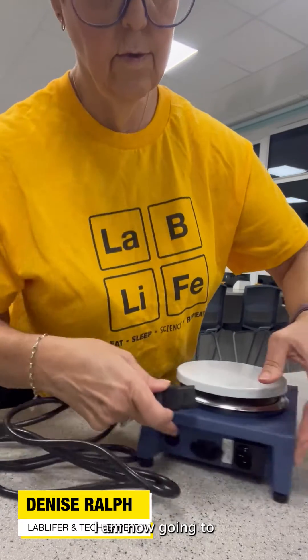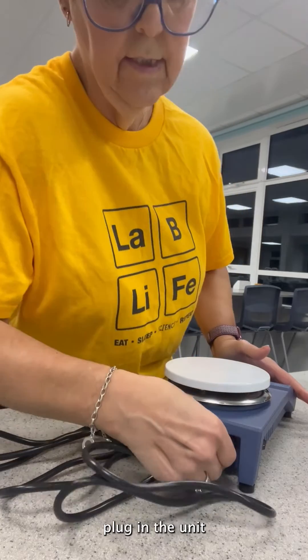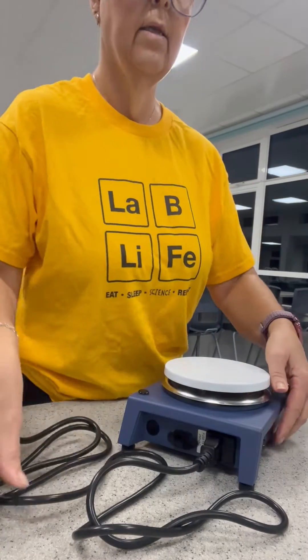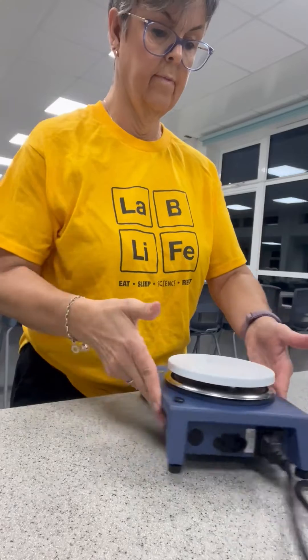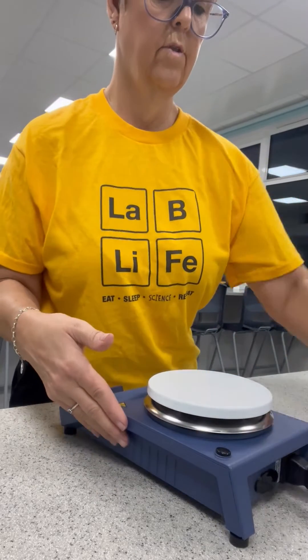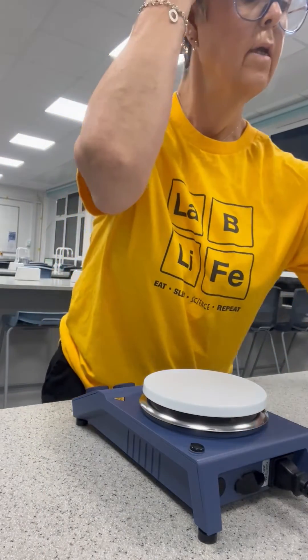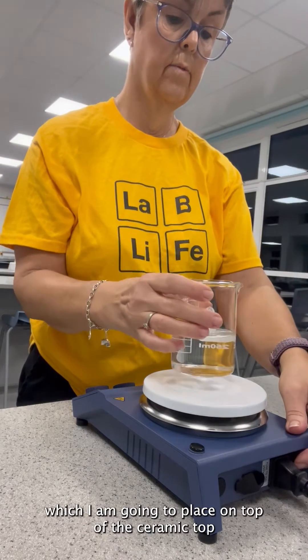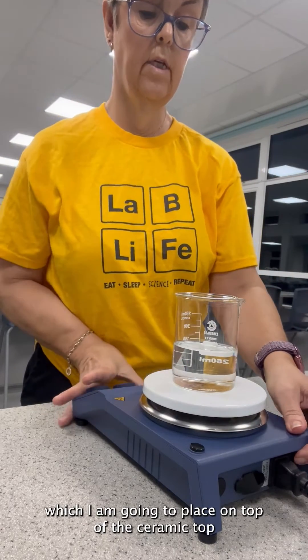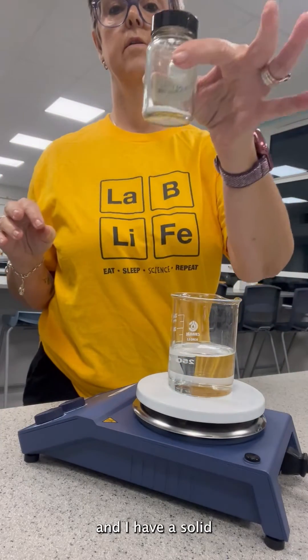I am now going to plug in the unit and switch it on. I have a solution here that I am going to place on top of the ceramic top, and I have a solid.